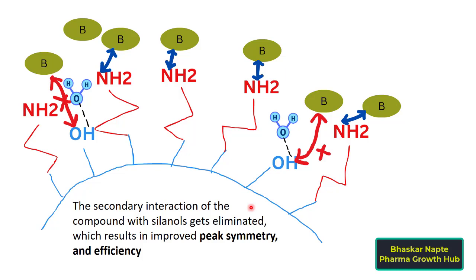And what is the benefit of elimination of the secondary interaction? Better peak symmetry and increased plate count or efficiency.